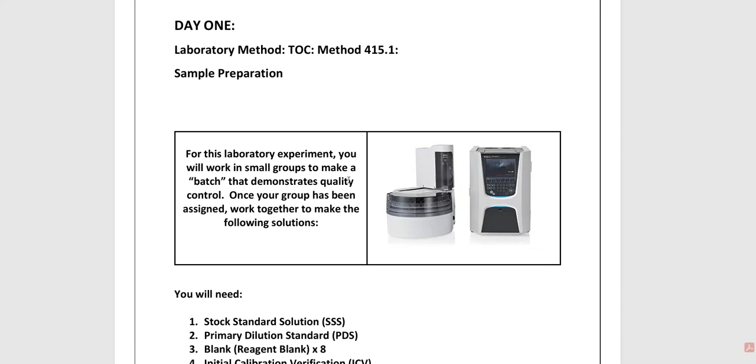And because it's your first one that you're seeing this way, we need to go through the motions and make sure that you can follow suit, read the directions, include what you need to include, write down the data, print off your receipt tickets if needed, attach your batch report to it, and then figure out if the batch of samples that you ran, can we pass those fully? Can it 100% go as far as yep, we did our job, everything was okay, everything went smoothly, there were no issues at all. Release the Kraken!